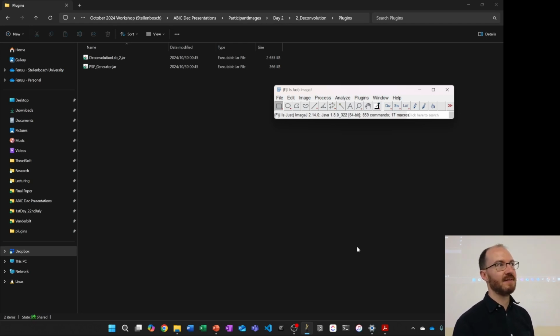And you would do that across biological repeats as well? Yeah. Not just one set of biological, but technically yeah, you would adjust, and then the next biological technical. That's also somewhat of a tricky question, because you have to determine how much changed between the biological repeats. Sometimes you accidentally put a little bit more stain in, or the cells are more dense or whatever. It's not always an exact one-to-one thing. Then you might want to use different parameters to get things more consistent before the analysis. But if you kept everything consistent, then the analysis can also be.